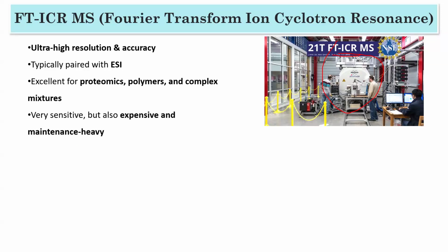So why in FTICR do you need this much big size? Because you are having a magnetic field. You see a magnetic field in NMR also. If you want to produce a very high magnetic field like 10 Tesla, then you need some superconducting material, right?